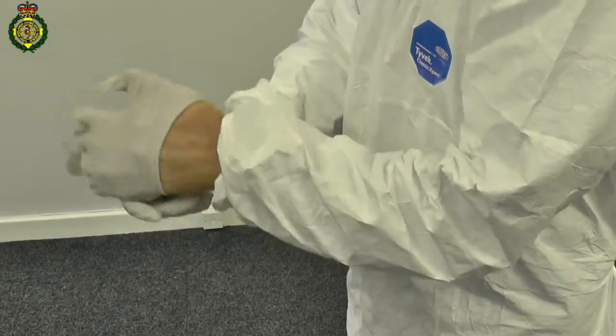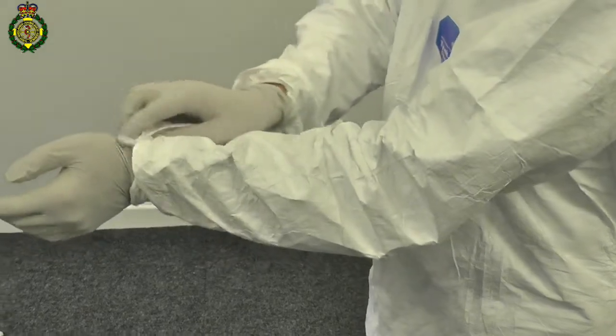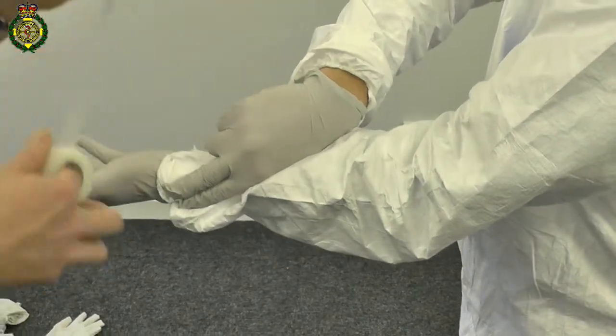Already wearing the Tyvek suit, put on the first pair of gloves. Then fold over the cuffs of the Tyvek suit and tape the cuff to the glove.